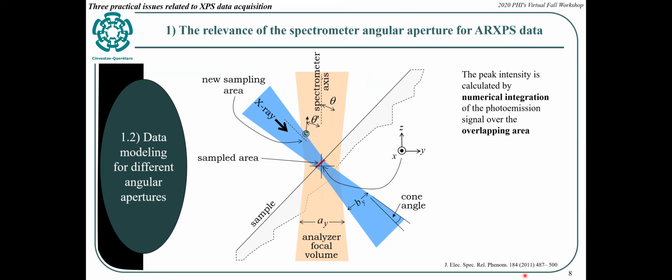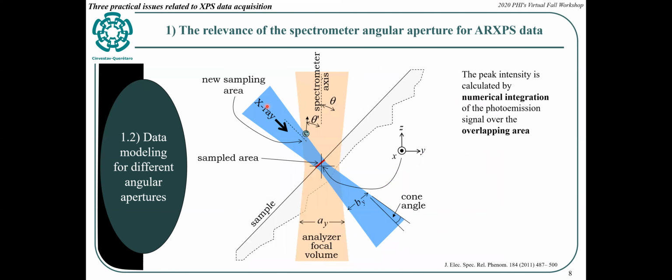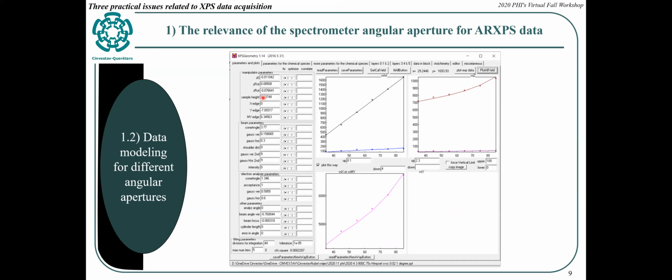Everything is described in this paper. This is a software that we use. It's called XPS geometry. And you can see that all the geometrical factors that define these shapes are input in this software, so we can reproduce the data. It's a numerical integration. In this case, I'm using a 40 by 40 grid.